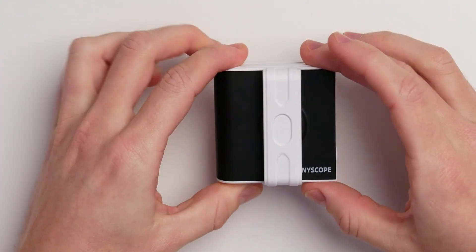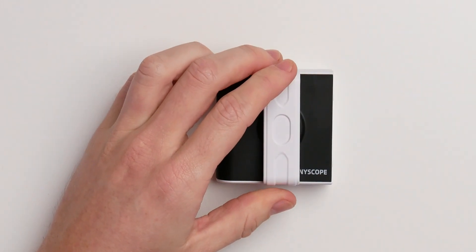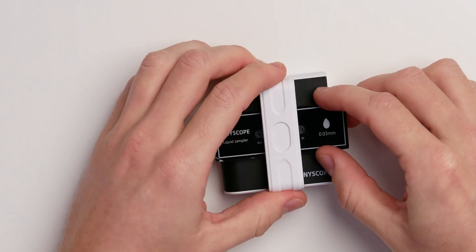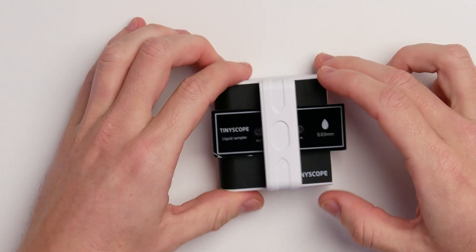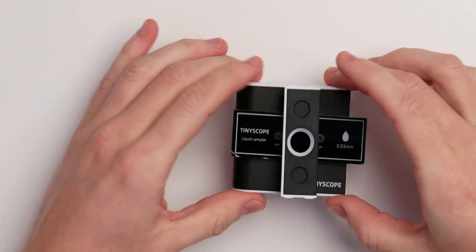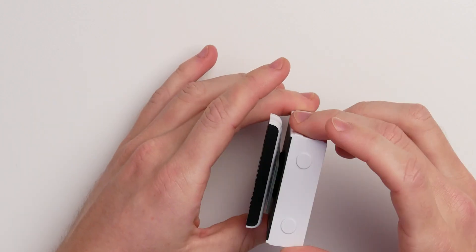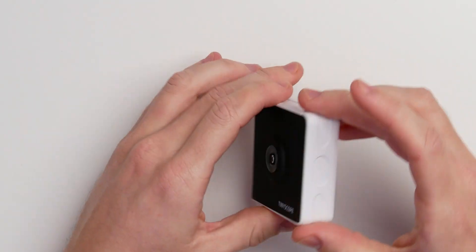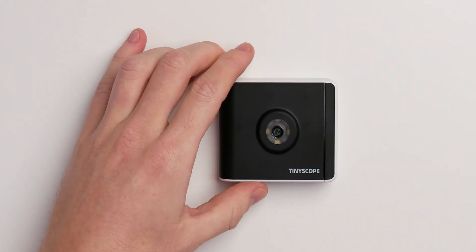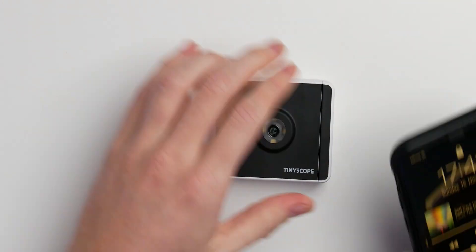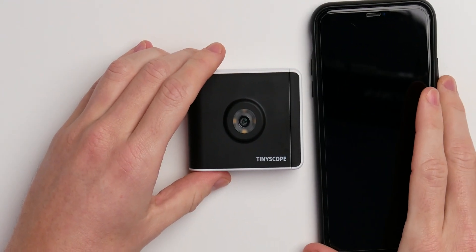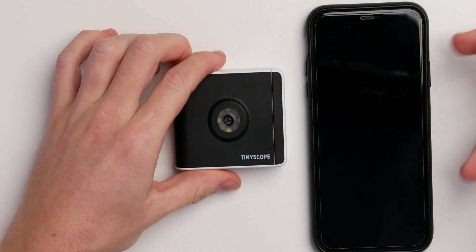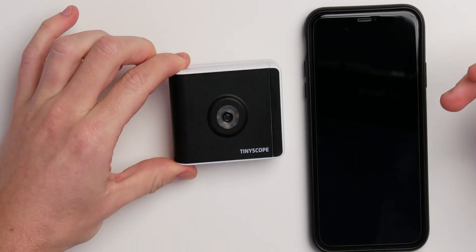So you can just pop this on like here, so it's now held in place. The probe sampler like this would be held in place and you can just swap this around to the white side if you want to. So this is the complete idea of just using it. And I'll pop this back on. In my opinion, pretty cool. Just compare it with a modern iPhone. This is an iPhone 11, this is the TinyScope. So when it comes to the footprint, pretty cool in my opinion.